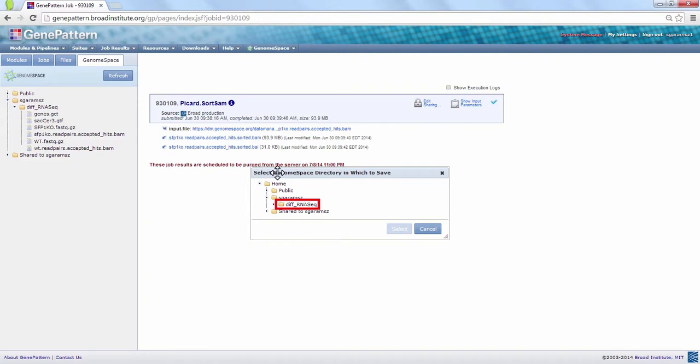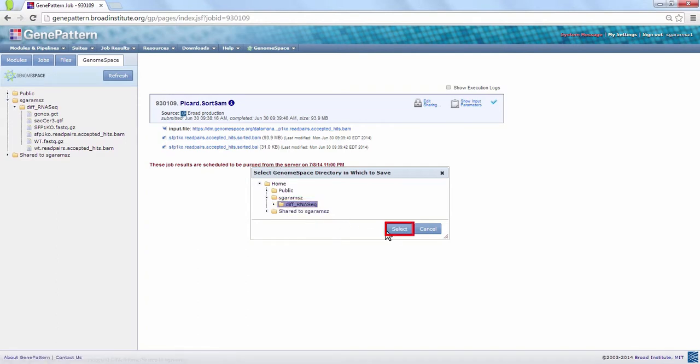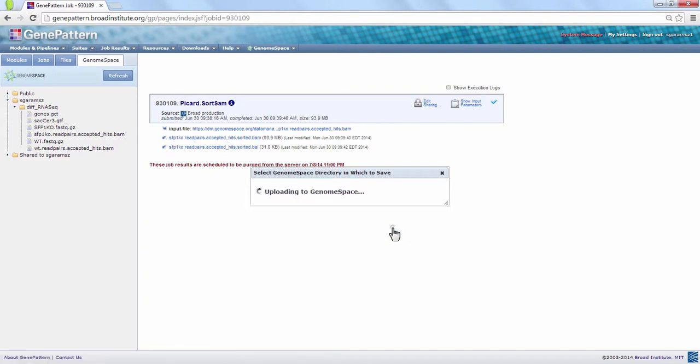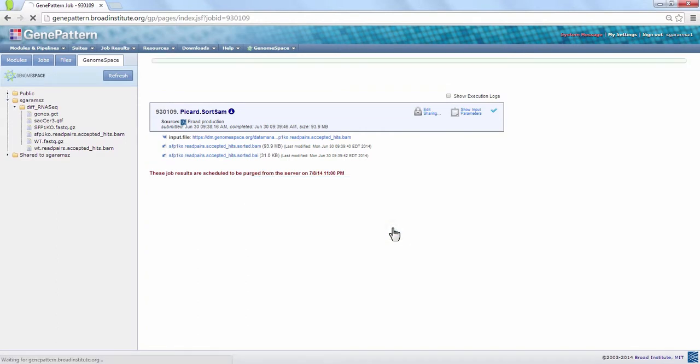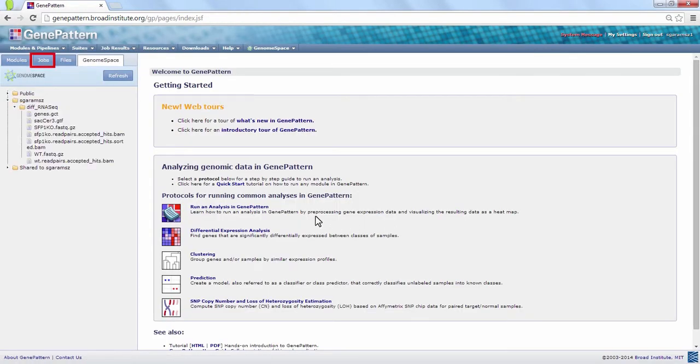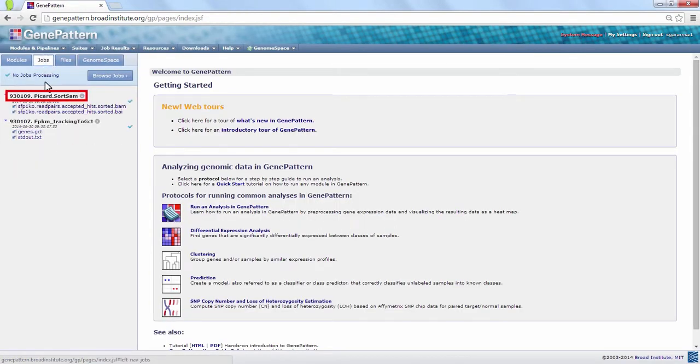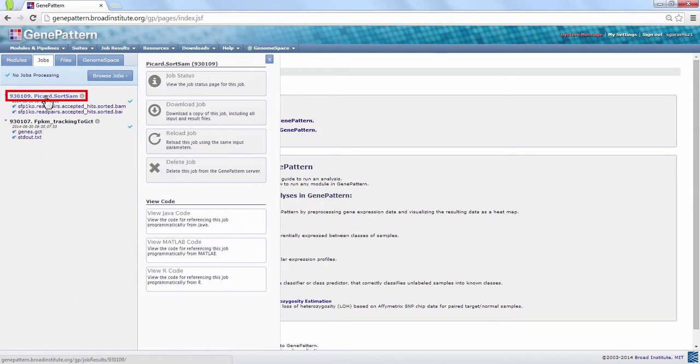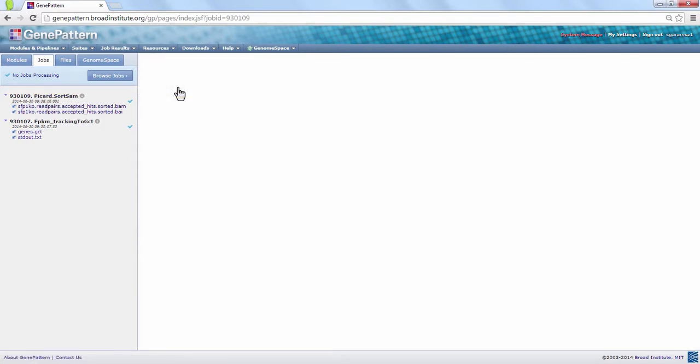Keep in mind that programs will often require that paired BAM and BAI files be located in the same directory, so try to choose the same folder for both files here. Return to your job and save the BAI file.